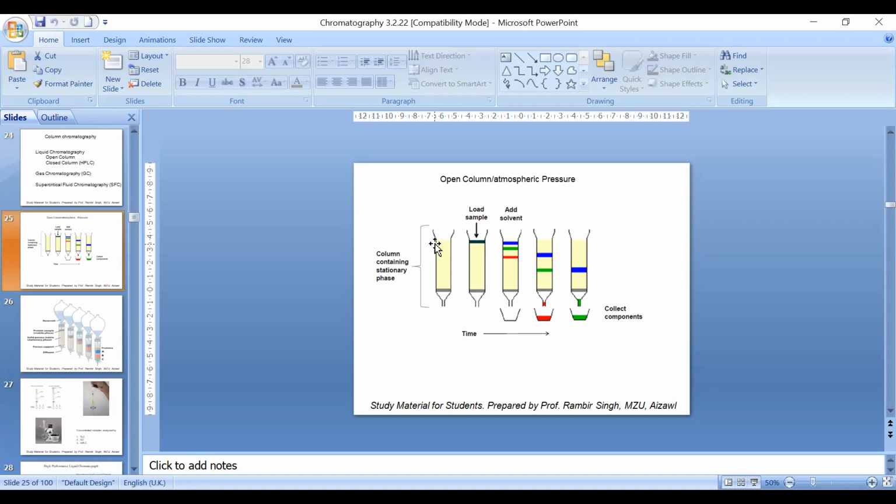No, you explain it. Your answer is correct, but your explanation is incorrect. So if I have a particle size of say 1 centimeter diameter, and suppose that particle has 10 retention sites. Now suppose in the column there are 100 particles. So that means total retention sites are how much? 1000.